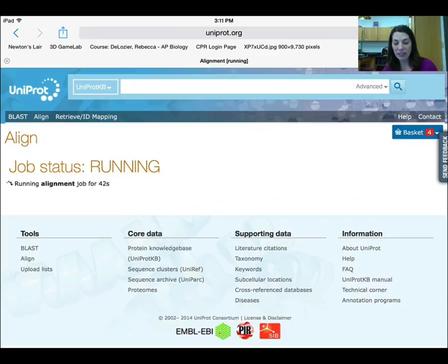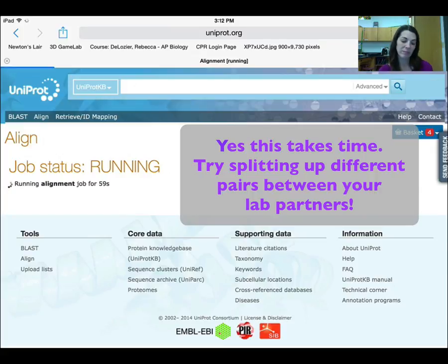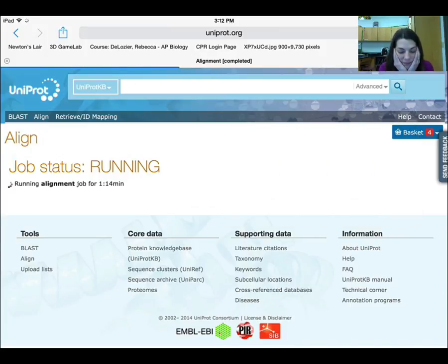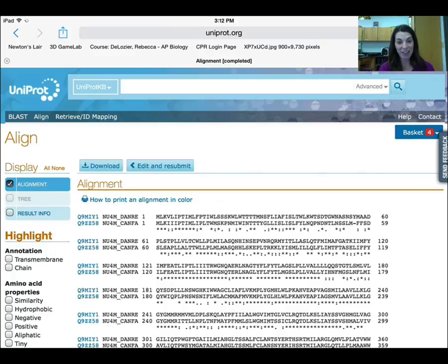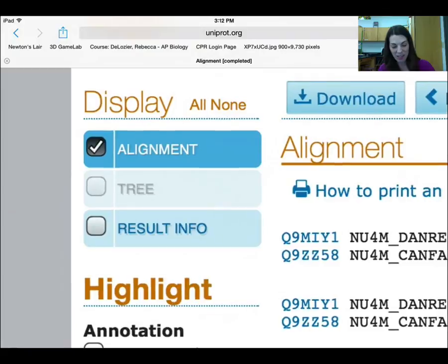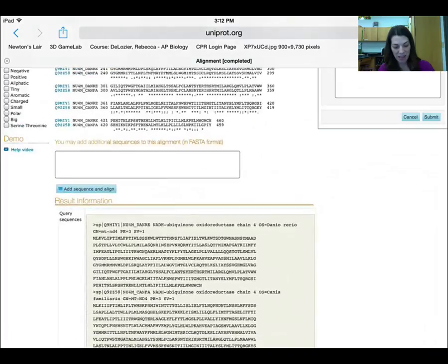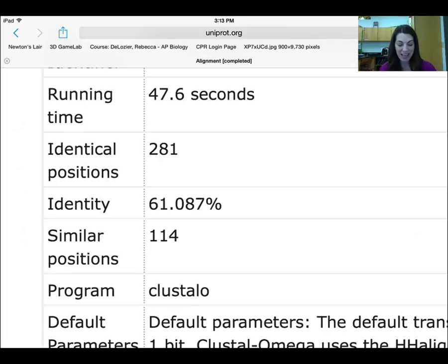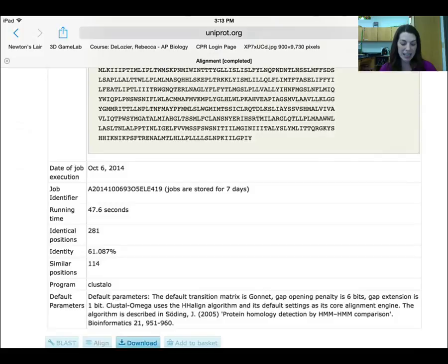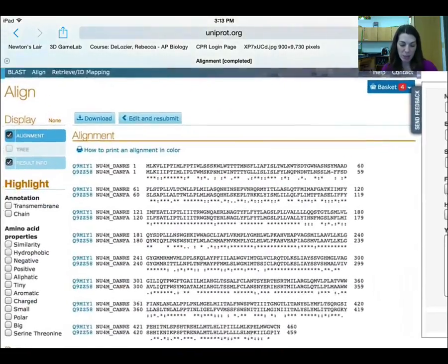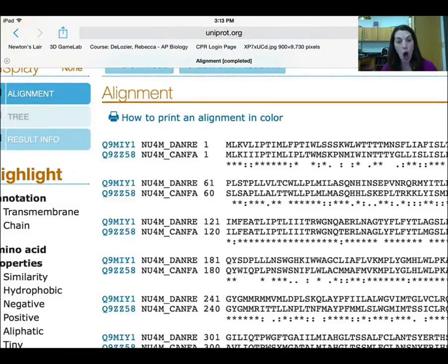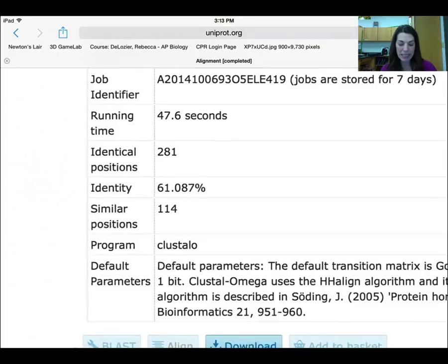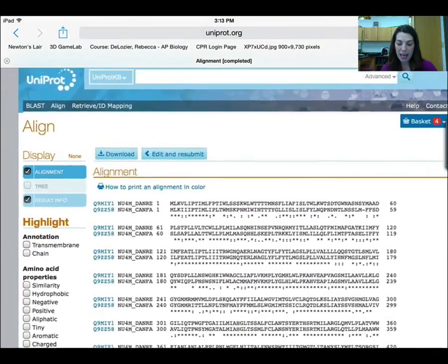We're waiting — this is taking a little longer; apparently there are a lot of people doing BLAST searches right now. Okay, now it finally lines just the two up. What you do is go to where it says 'result info' and click it, then scroll all the way down to the bottom. Magically, it tells you how many identical positions there are and gives you the percent identity. That's the number you want. So if I was filling out an identity matrix for zebrafish and dog, the percent similarity would be 61.087%.